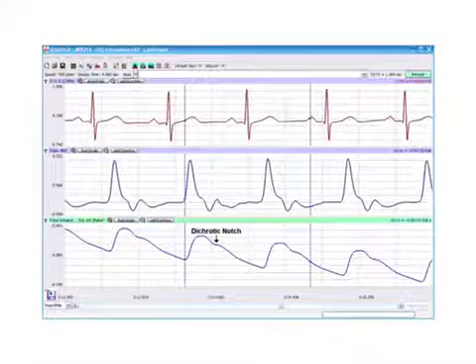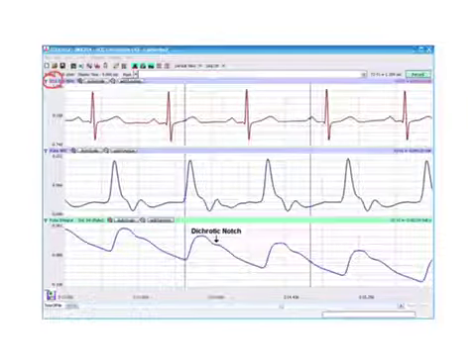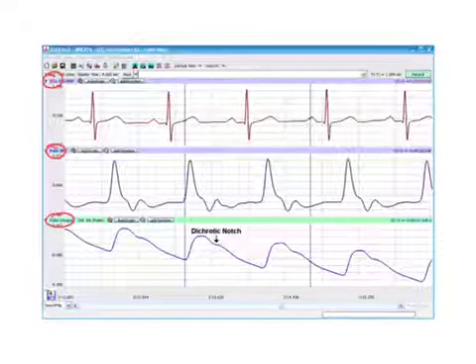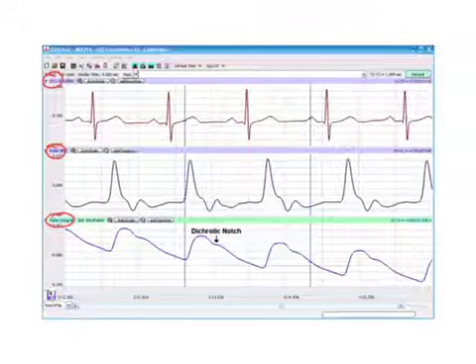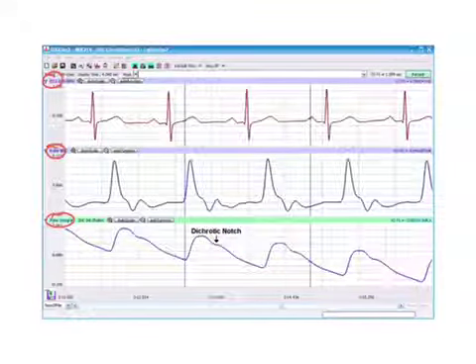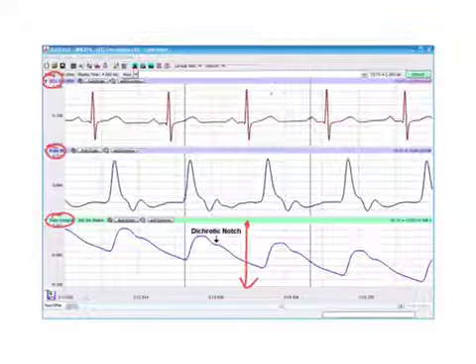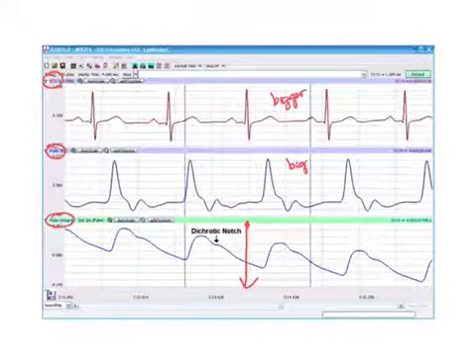So when you open up the file, it will look something like this. It may look a little different because this is a stock photo, but 3 windows will pop up. You can see here's the actual EKG. This shows you the pulse and then the pulse integral. I normally ignored this channel. Quite frankly, it's in the way. So you grab the arrow to shrink this down, and then these 2 can get bigger, okay? Because we only need these 2.